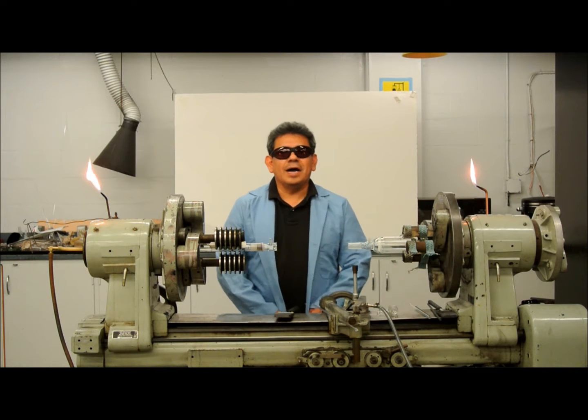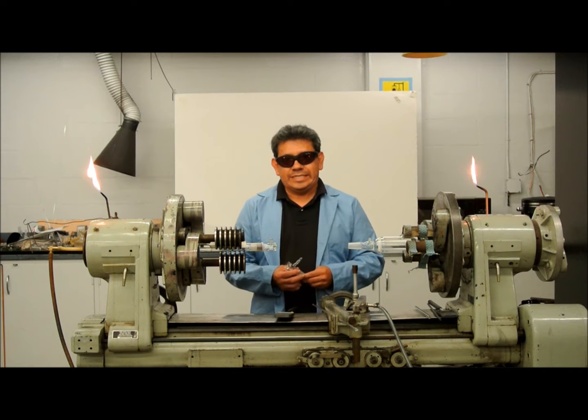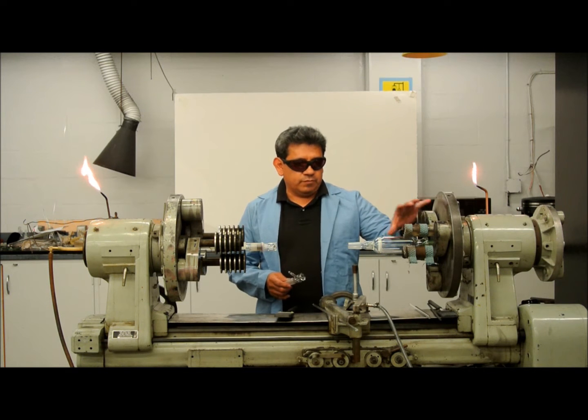Hello, my name is Roger Ramirez. I'm a master scientific glassblower. I've been doing scientific glassblowing since 1980 and I'm going to repair a glass filter pressure funnel. The stem broke on the inside.